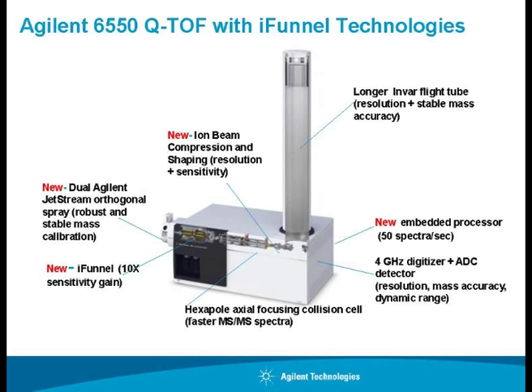But we are saying here that my mass spec cannot see mass as such. It has to be charged, meaning the language which my LC is talking cannot be understood by my mass spec, isn't it? So we need an interface, which is called an ion source, in this case electrospray ionization. That is an interface where the liquid is evaporated and only the charged analyte, in this case peptides, gets into the mass spec, which is under high vacuum.